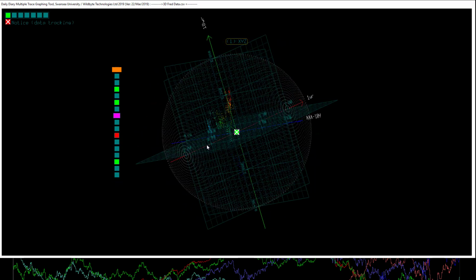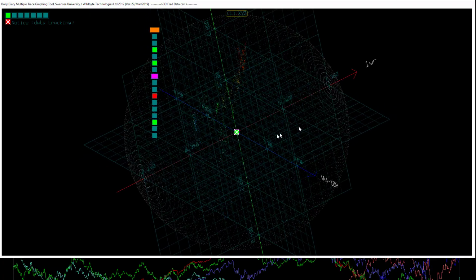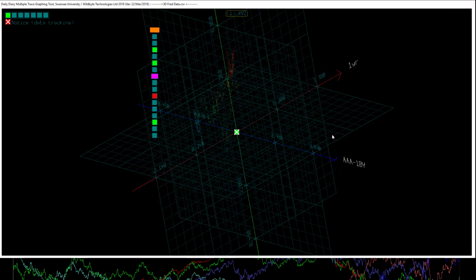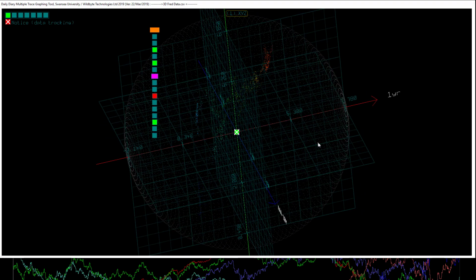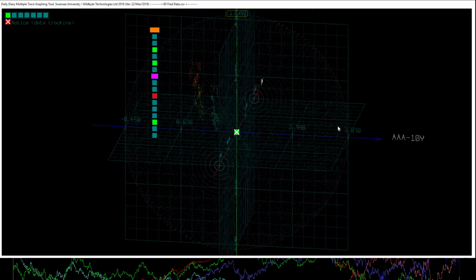It gives the scale for each axis, which can be vastly different from one to the next, depending on what you're looking at. As I said before, the data at the center of the graphic, or the origin of this 3D graph, is not 0, 0, 0. It's based on the data you're looking at. The data will, by default, auto-centralize on each of the three axes and normalize.